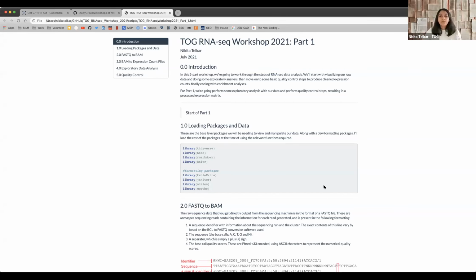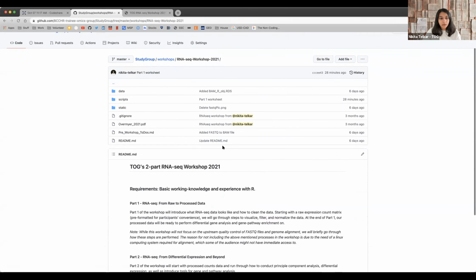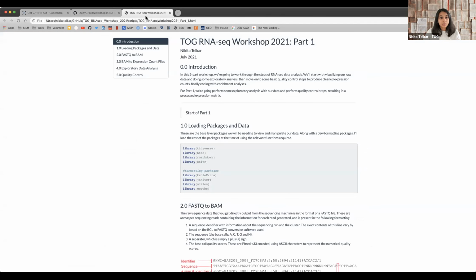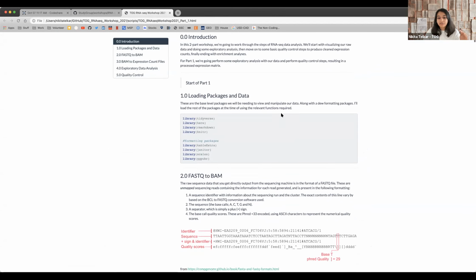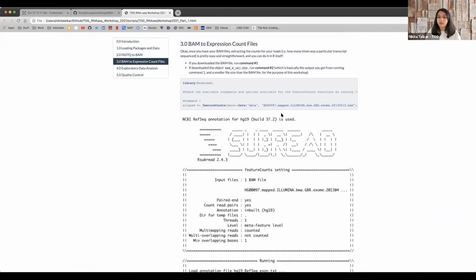Everything that I'm going to be talking about today is available on our GitHub page over here. If you go into BCCHR Trainee Omics Group study group, RNA-Seq workshop, you have all of the files that you would require. Even if you miss steps in the tutorial, each of these files, labeled as TOG RNA-Seq workshop part 1 or 2, has a full write-up of all the steps that we will be performing. So I will be going slowly, but this resource is still there for you if you want to do it on your own time.